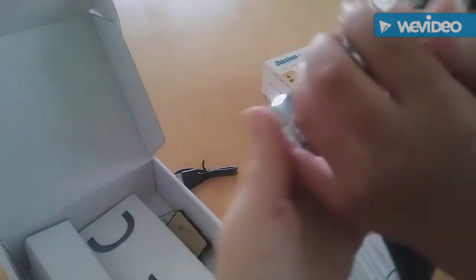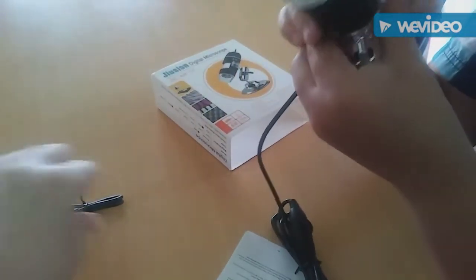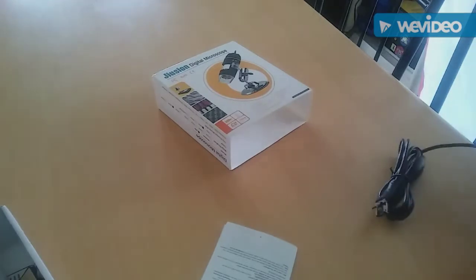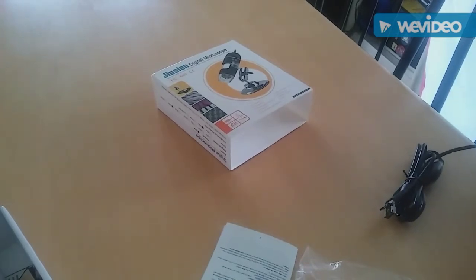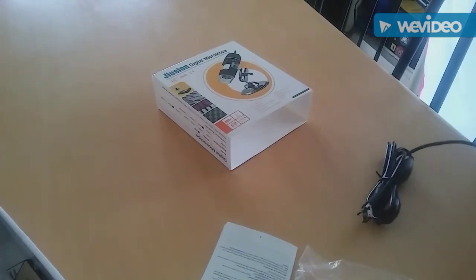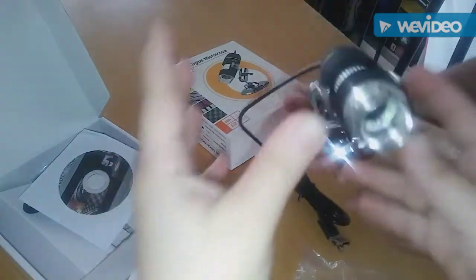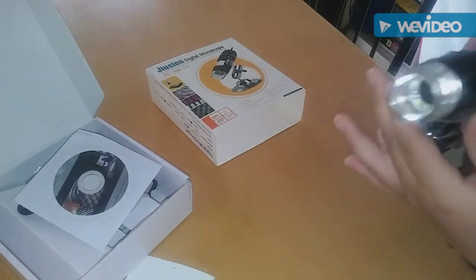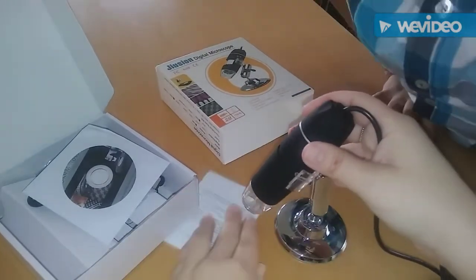It also comes with a stand here. And here is a USB plug charger for your WiFi box. Noah got it all together here — there's the stand, it goes like that. The hole has to go in there. So Noah figured it out. It has this cool little stand so you can just zoom in to whatever you're looking at and you'll be able to see it through your phone.